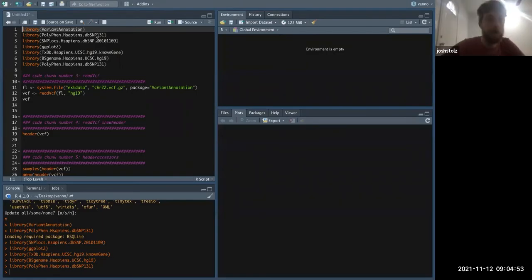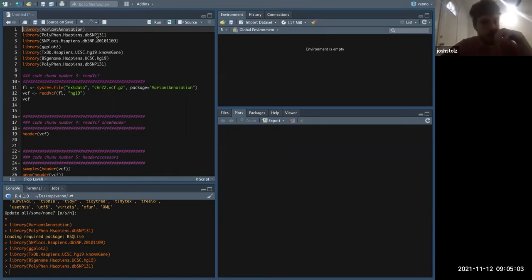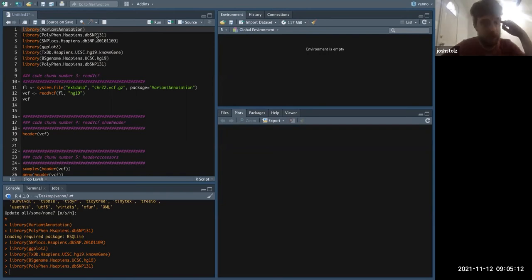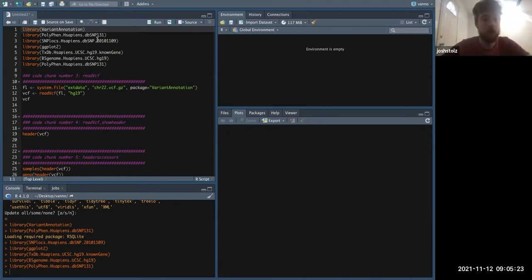Good morning everyone. We're going to be doing the variant annotation package today. We're not going to work directly with our genotypes at Lieber, but as an R package, this is probably the best equipped to handle our genotype information. They have a workflow that I linked in the Slack channel and we'll be going through that.